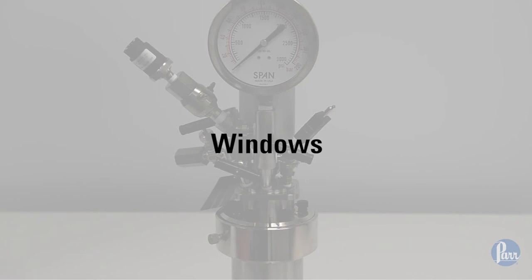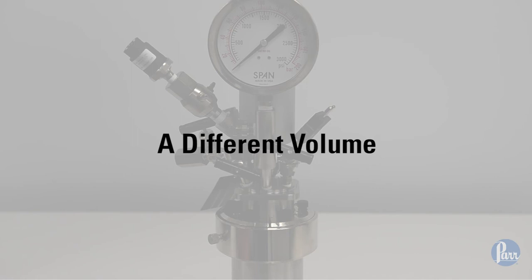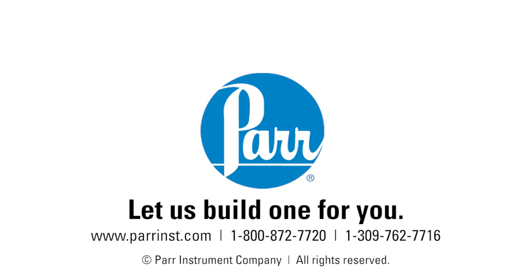We also have accessories like glass or PTFE liners, reflux condensers, catalyst holders, and alternate stirrers. If your research requires something that you didn't see here today, please call us and talk to us about it. We'll be happy to customize something for you and build one for you.